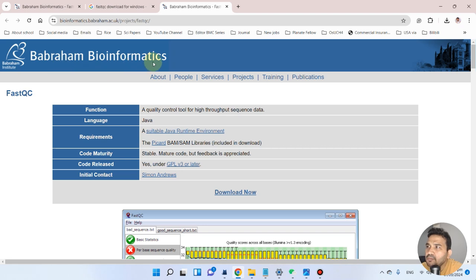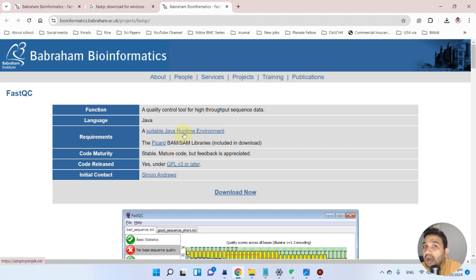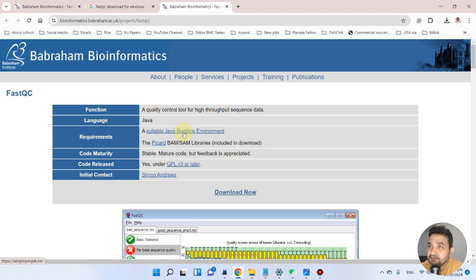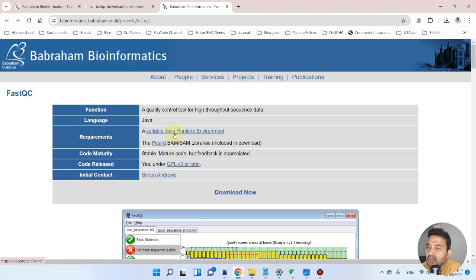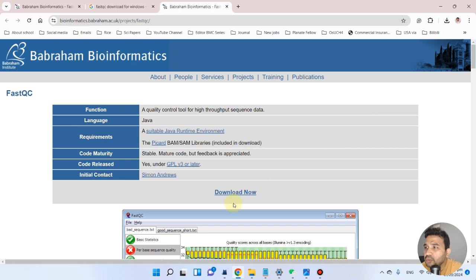That link takes you to the Babraham Bioinformatics website. We actually need two software: one is FastQC itself, and the other is the Java Runtime Environment, because FastQC is based on Java. So we need to download both to run FastQC. If the Java Runtime Environment is already installed on your computer you may not need to download it again, but if it is not previously installed, you will need to download it.